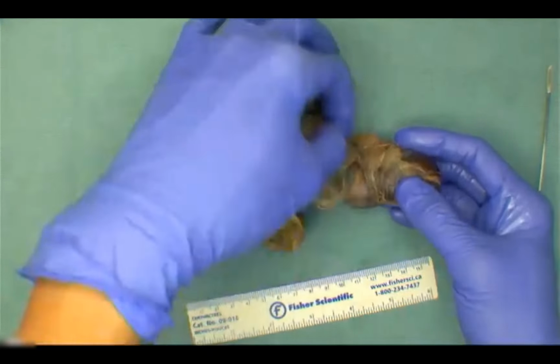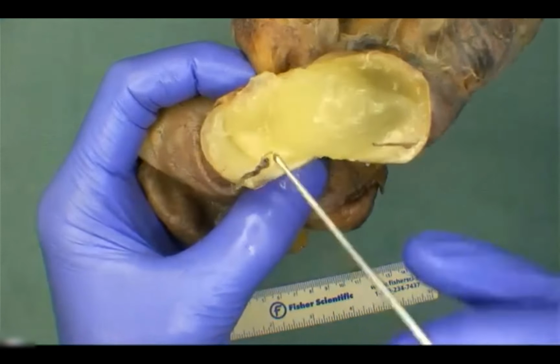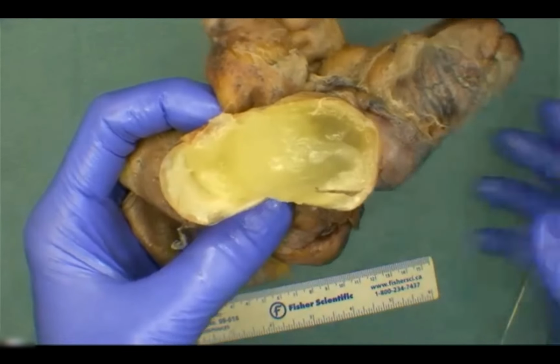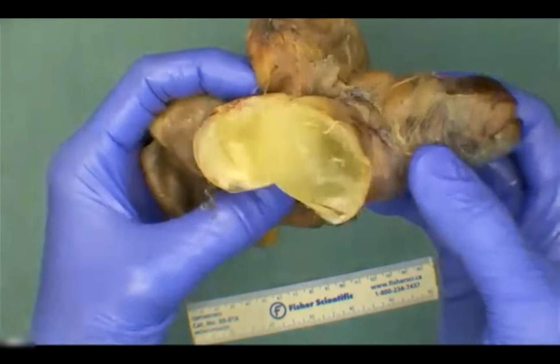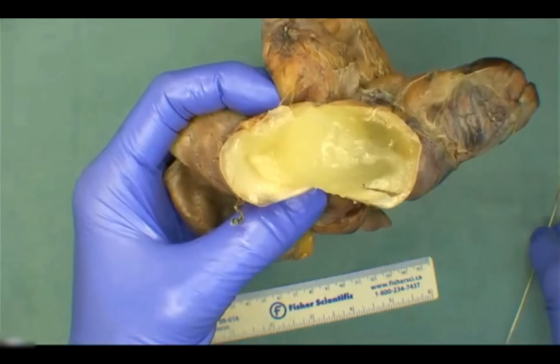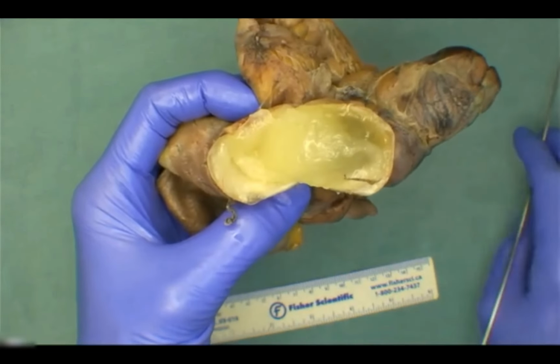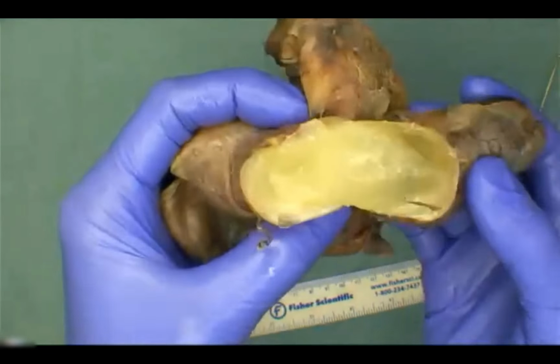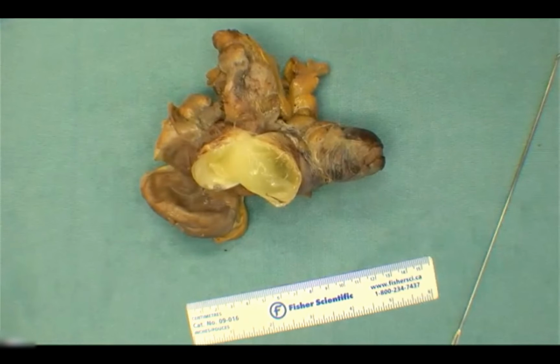Yeah, so the mucin that stays in will actually leave, but I think you can see some of this mucin at the center kind of splitting away. So that way I don't typically submit that. It's really just anything that's attached to the rim of the wall of the appendix that goes through. And they'll end up being little strips because this won't fit necessarily in a transverse slice into a cassette. And so we'll end up having to either bisect and then just take strips from each half into a cassette. Would you fit in a cassette? Probably no more than 2, I think, given the diameter of our appendix. And depending on where we are, if it's a little bit more round, maybe only 1 would fit.